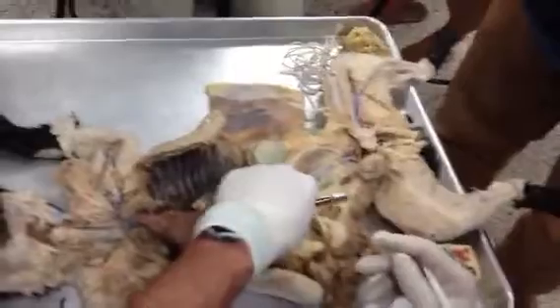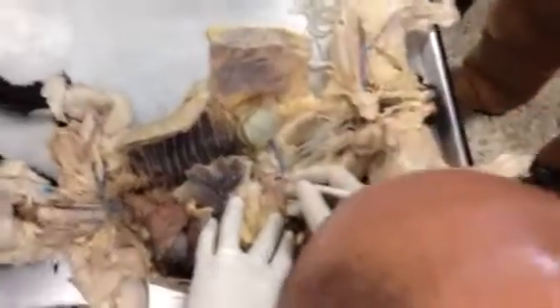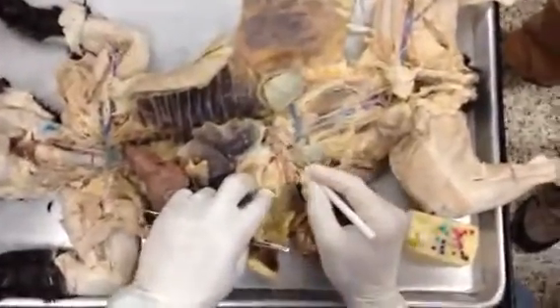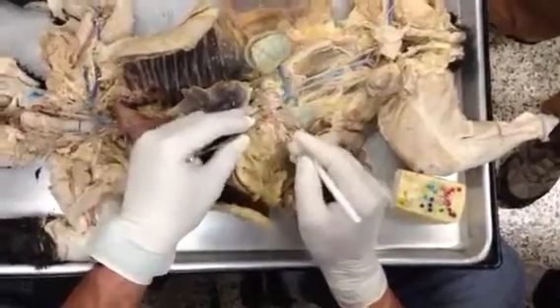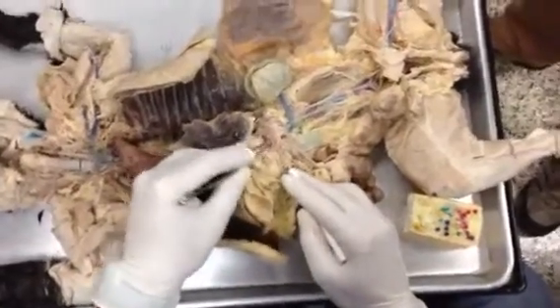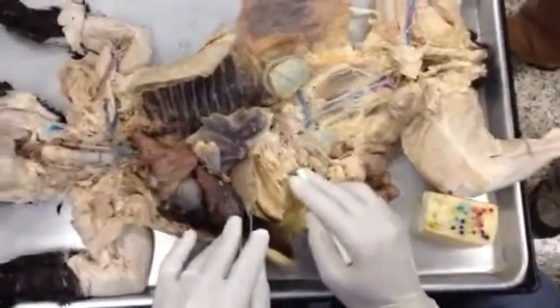Now the arteries, folks, when we cross the diaphragm, you're going to look for two arteries. The first one right under the diaphragm is the celiac artery. And the celiac artery is going to continue on, and there are going to be three branches that come off the celiac. This first one right there runs under the stomach to the liver, and that is called the hepatic artery.